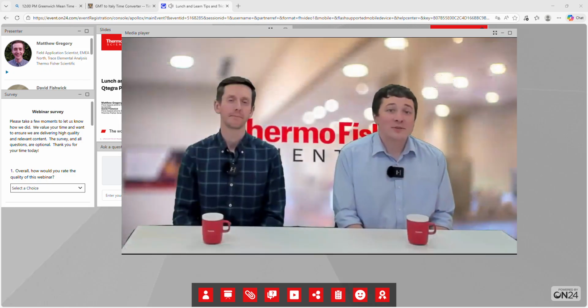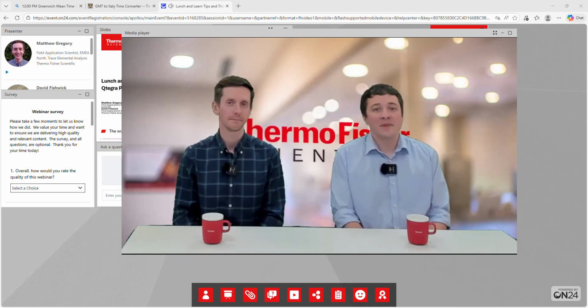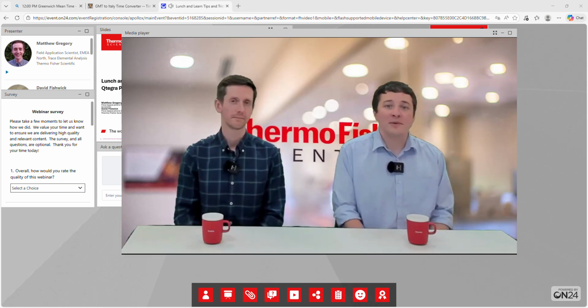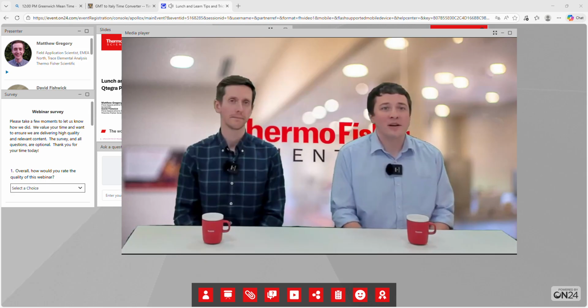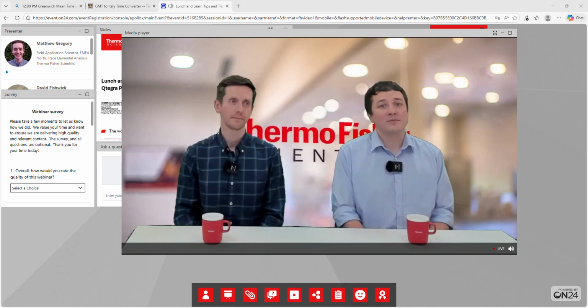So Matt's shown us some really useful tools there that we can use for our method development and to have a look at how interferences might be affecting our analysis. Sometimes we've no idea what's in our sample. They're brand new samples that we're doing method development with. So we've actually got some nice built-in tools that help us do maybe some survey scan or semi-quant of our samples so that we can see what else might be there.